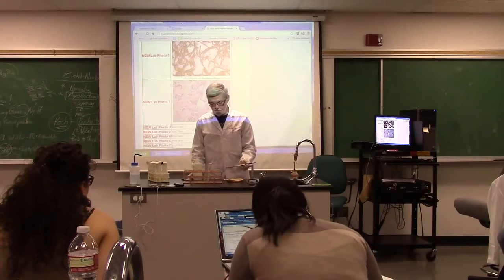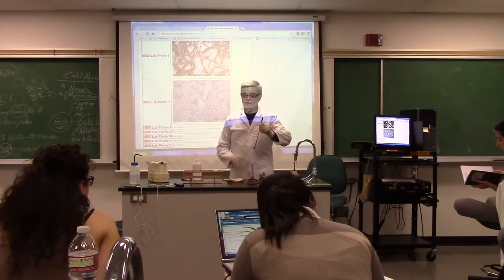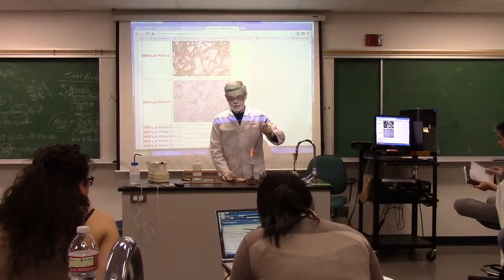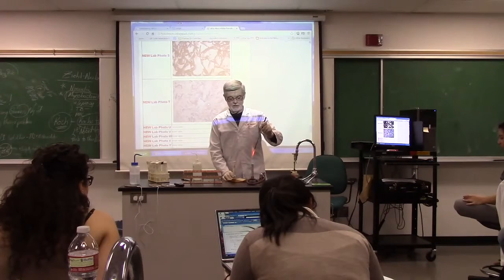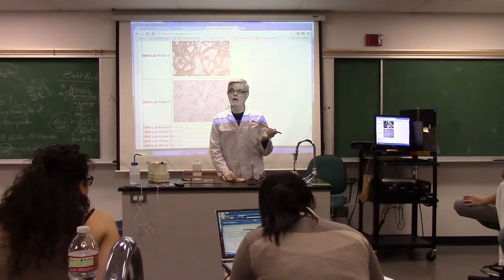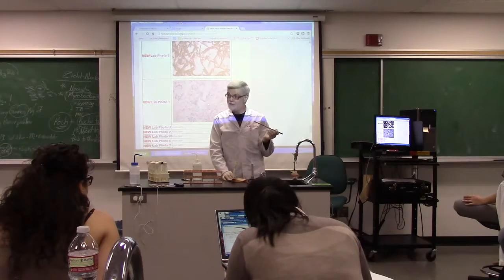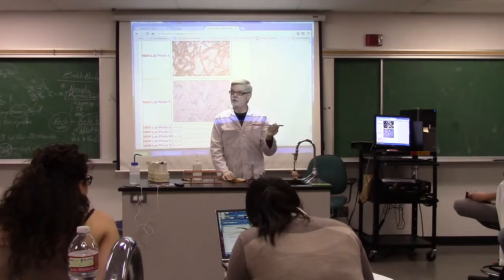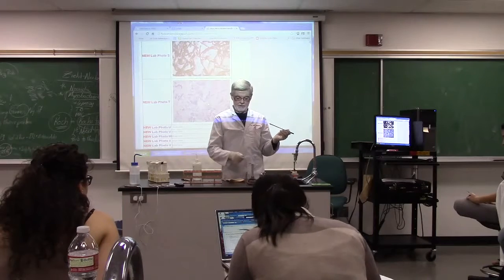So I'm putting my drop of water on there. I'm heating this to red hot. Someone said in the other class, if you just heated it and you're using water that doesn't really have any bacteria in it, why do you have to heat it again? Good technique. You really don't have to. It's just always, you start with a sterile loop and you end with a sterile loop. Just good technique. Okay, you're going to flame the lip.